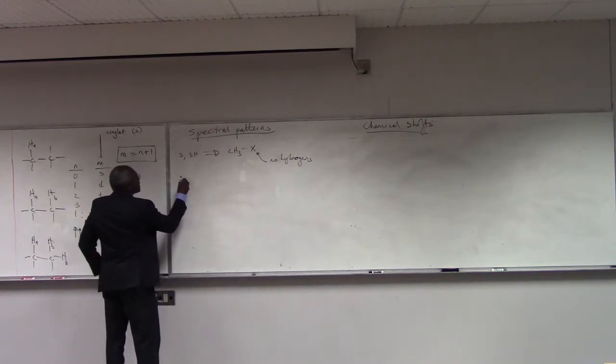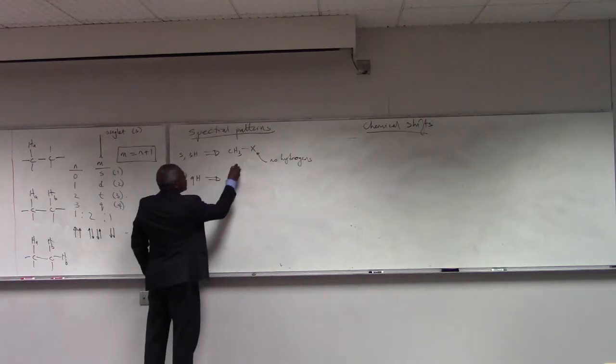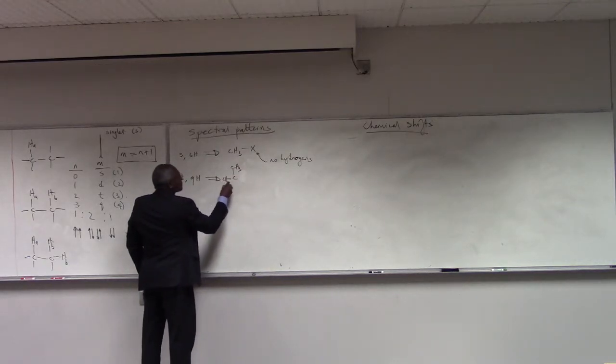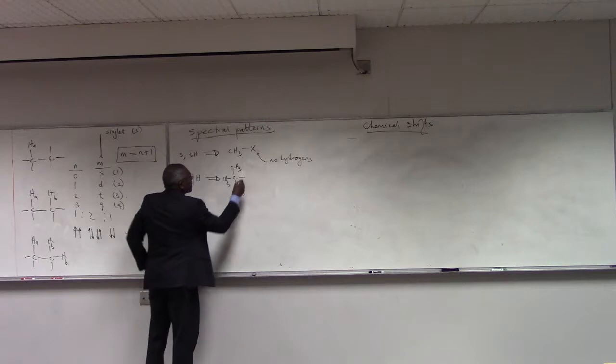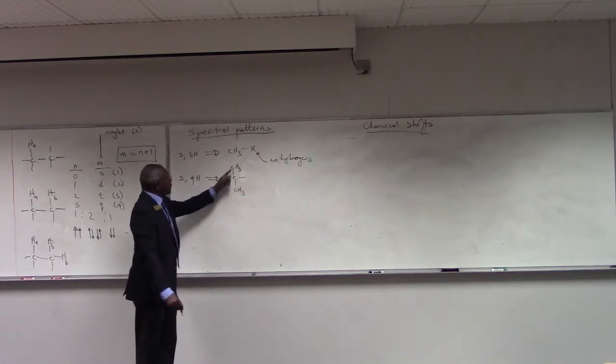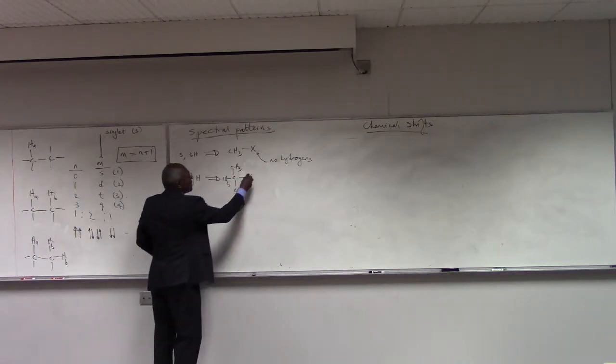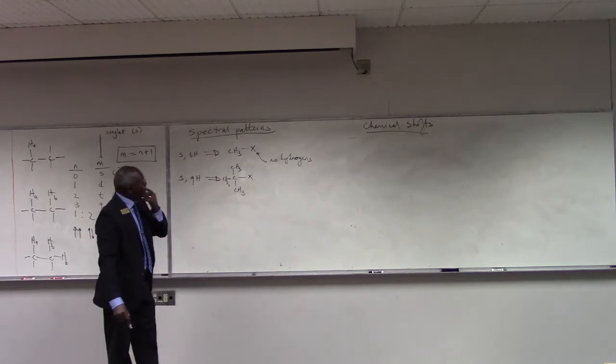If I have a singlet for 9 H's, that screams t-butyl, because all of these H's are equivalent to each other, and of course, their neighbor has no H's. So this screams of a t-butyl group.